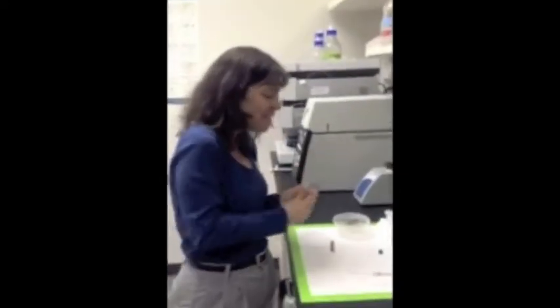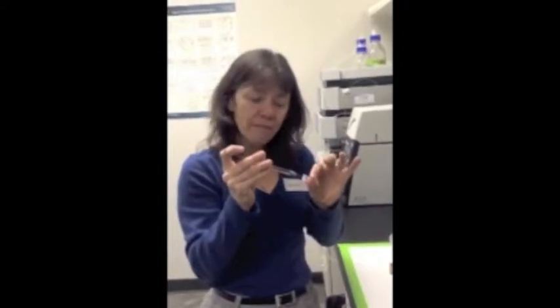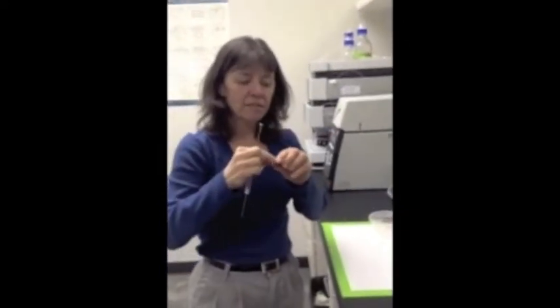But this is just to give you an idea of how tiny it is. We get very, very small amounts of these neurotransmitters, which we can then assess using this equipment, which is typically thought of as equipment used by chemists, but even psychologists can use it, like me.